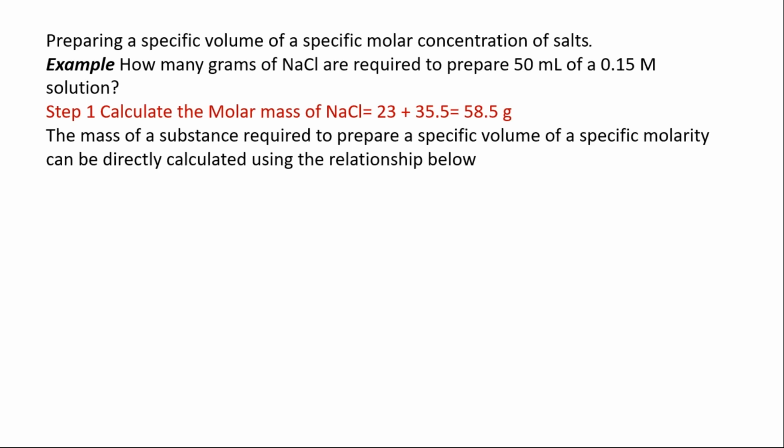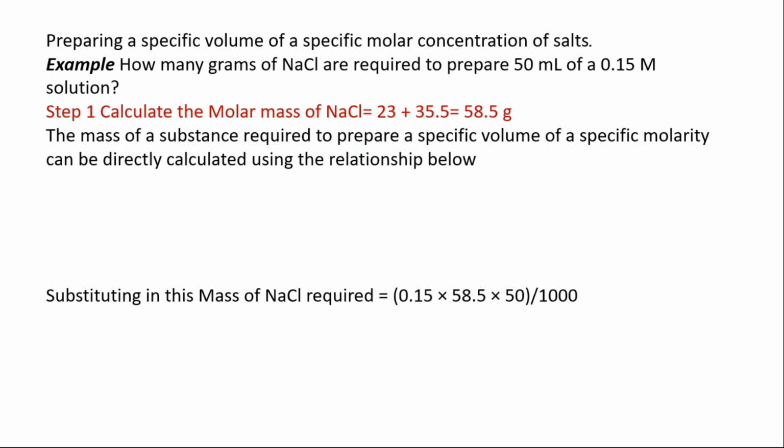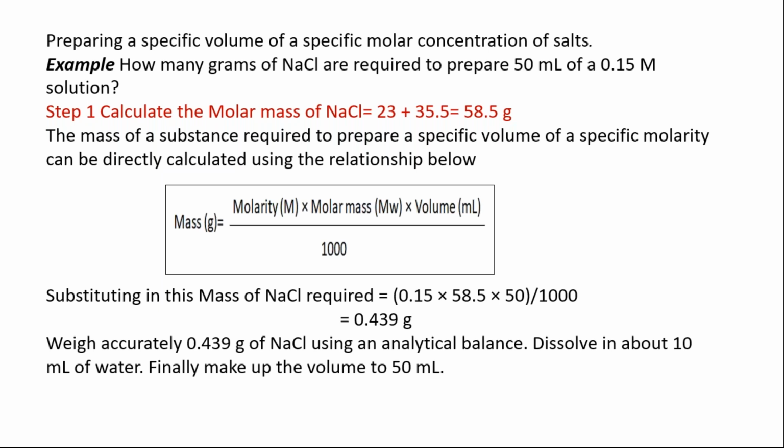The second step is we need to know the mass of the substance required to make the specific molarity solution. So the mass required, you can use this relationship.